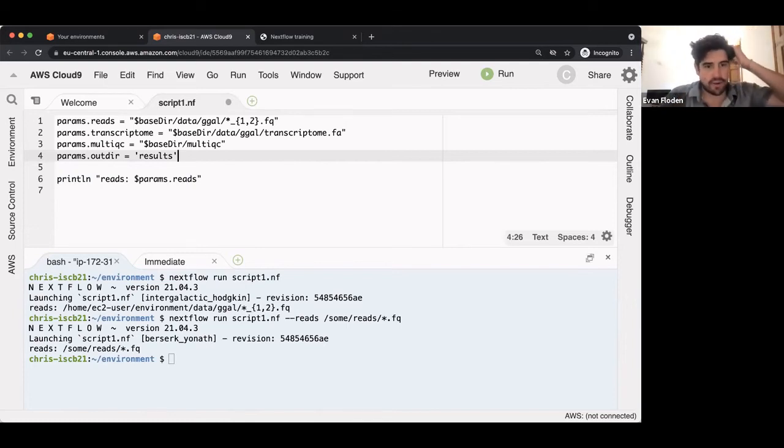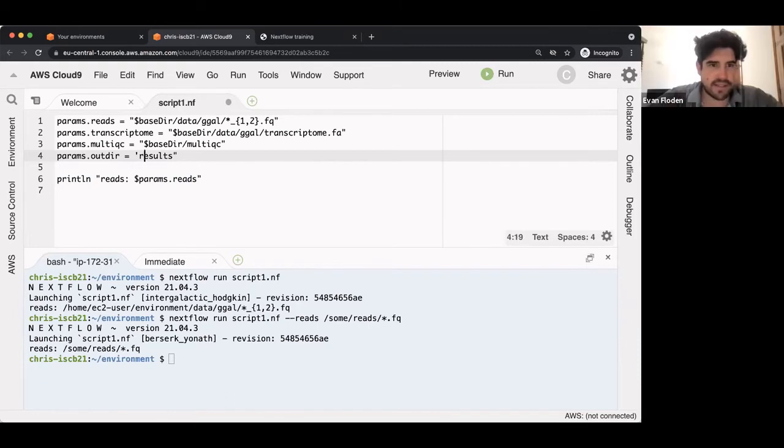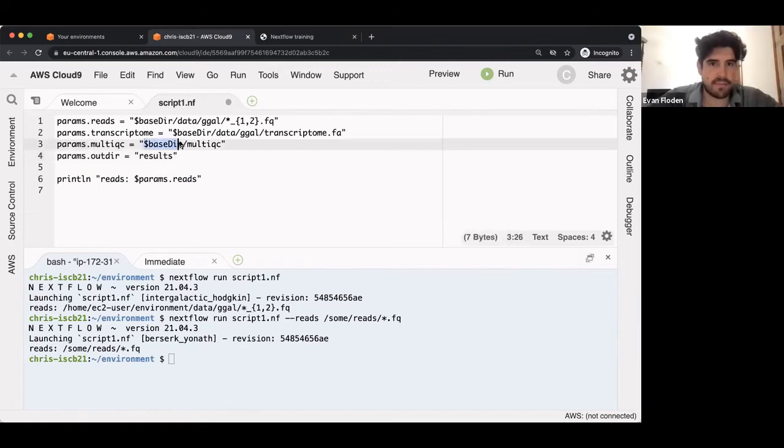Does it matter, the single quote versus double quote? In this case, absolutely the same. Yeah. They're the same, okay. Yeah, so the double quotes will be if you need to use variables, like the $projectDir. And the single quotes that we're going to use are just a simple string, no variables.